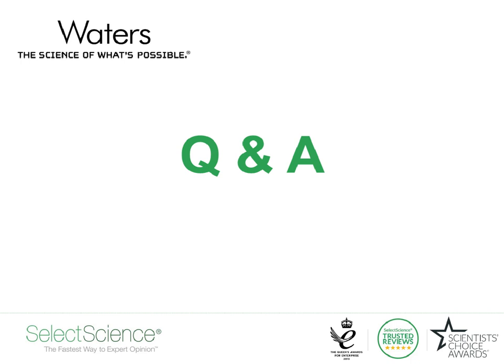If I interpret that question, can we tease apart which of the different actors are contributing to the signal? I guess the question is about if the sample itself has multiple unknown organisms in it. So the sample is kind of crude in nature. So the question is, is it possible to study a crude sample using DESI-MS?